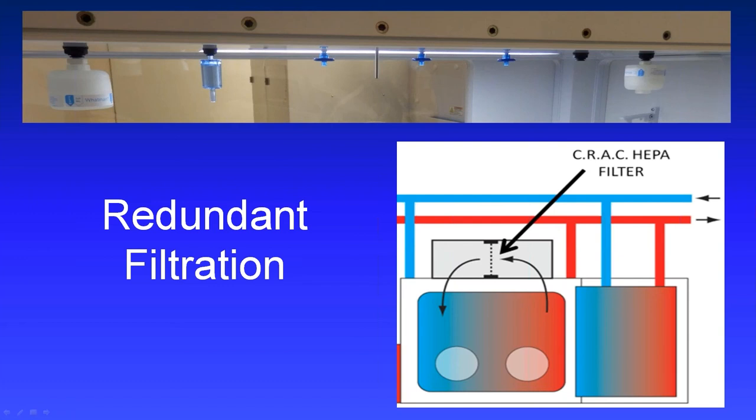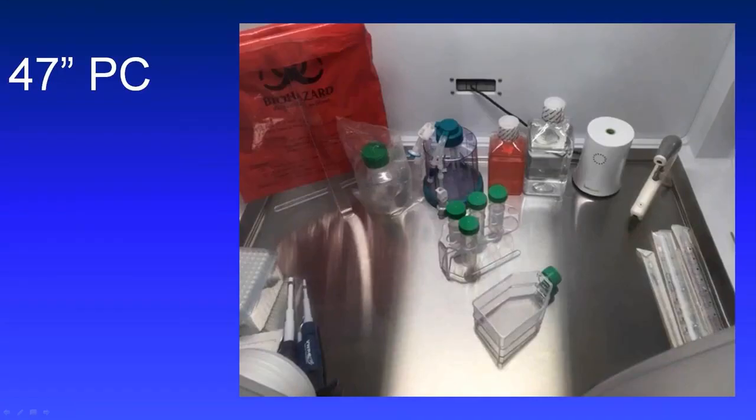The continuously recirculating atmosphere cleaning system, or crack system, operates at all times like a refrigerator, and this is something that you want to leave on at all times, so don't turn it off. We have had some customers that have thought that they would save some energy and just turn it off at night, and that's not a good idea, and we'll show you more about that as we go along.